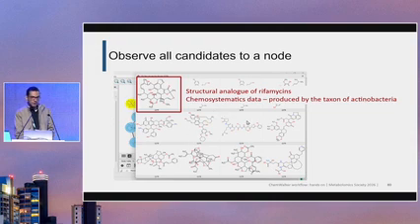And you must select the structures that make sense for your study, that make sense for the organism that you are working with. I selected the structural analog of rifamycins with the naphthoquinone derivative ring, and the chain known as the ANSA chain in rifamycins.